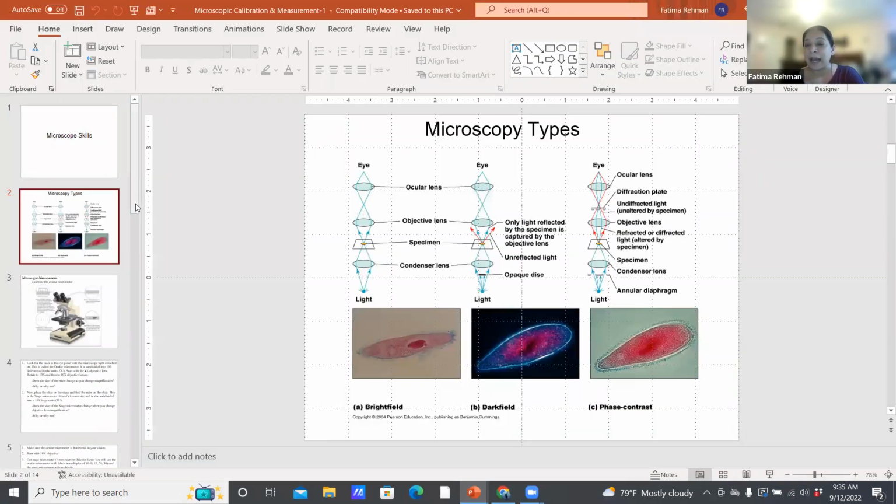Okay, so the microscopes that we have in our lab are what we call compound microscopes. Why are they called compound microscopes again? I think we went over it a little bit before, but I would like to make sure everyone has that right. Anyone? It's hard to make talk when you are online. So why do we call our microscopes compound?